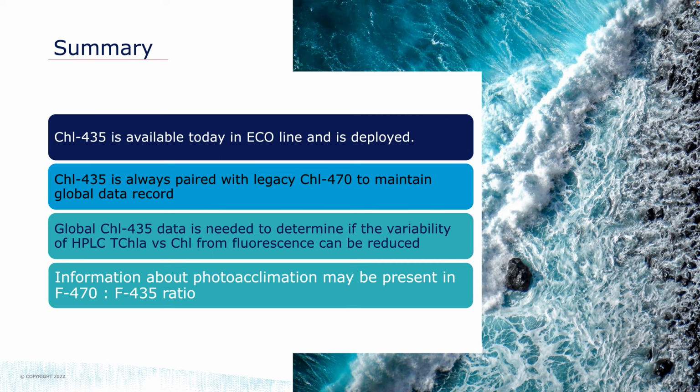One thing that you can do, there's two things that are part of the calibration. One is called the dark counts. And one of the things that you can do is just simply tape over the sensor, both the LED and detector windows, put it at a constant temperature. It doesn't have to be in water, but you can put it in water if you want. And just measure what are called the dark counts.